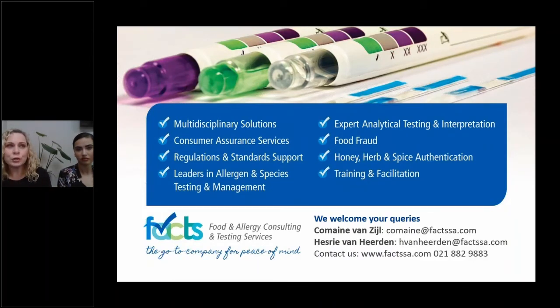So I guess it comes back to determining whether cross-contamination is possible. If you produce products with different allergens or different combinations of allergens on the same equipment or lines, yes, then you have to do validation and verification that would include allergen testing. But for example, let's use a bakery. Most bakeries have gluten or wheat and soy in all their products, right? Those are common allergens, so you don't need to validate the control, because those allergens are in everything. But if you have one single product that contains egg, and you want to make sure that all your products that contain soy and gluten or wheat are not contaminated with egg, then you simply need to validate and prevent the cross-contamination of egg. So I hope that answers the question.